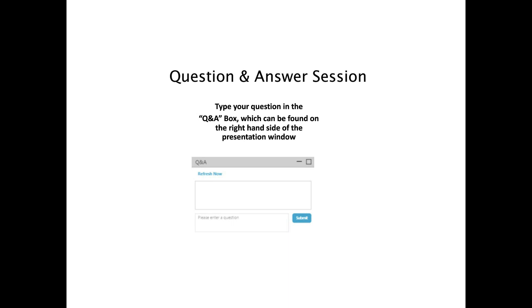Yeah, and I'll add to that, we can run with either configuration. So if you already have the Waters RI, you can use it, and otherwise you can use a Wyatt RI. So we can use essentially any RI detector that has the requisite low dispersion, which is key.